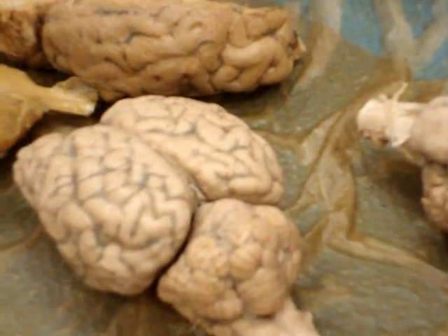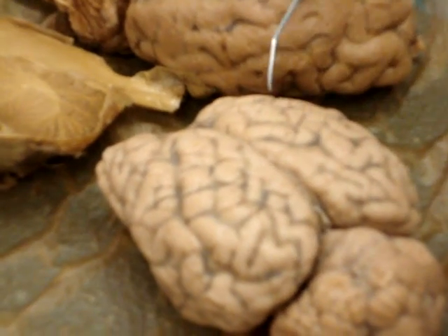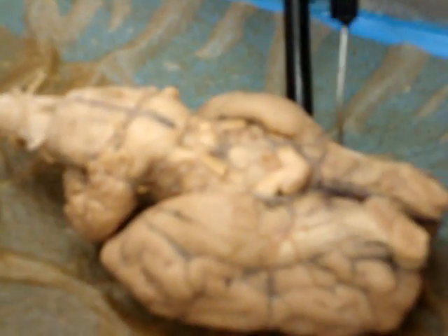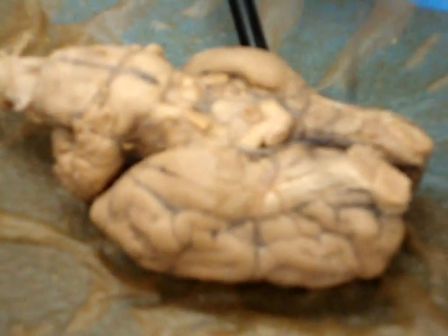That is the longitudinal fissure. There's a line right here. What is it? Central sulcus. There's more than one person in here. Now there's the central sulcus again. You can see it there. See, a blood vessel follows it. That black line is a blood vessel. All these black lines are blood vessels. It's very obvious where the central sulcus is.